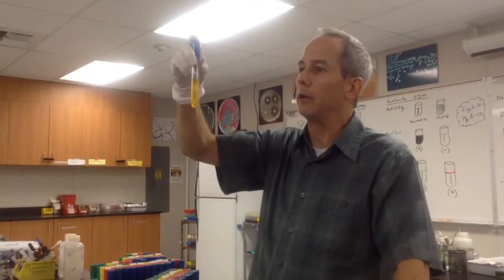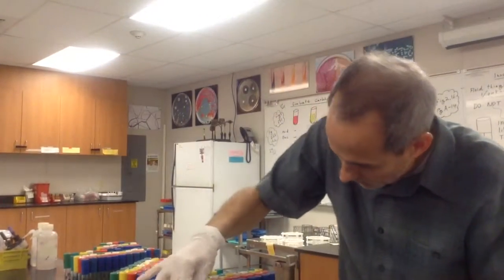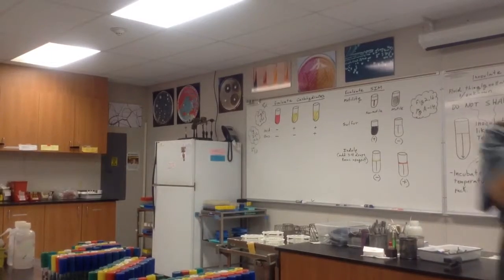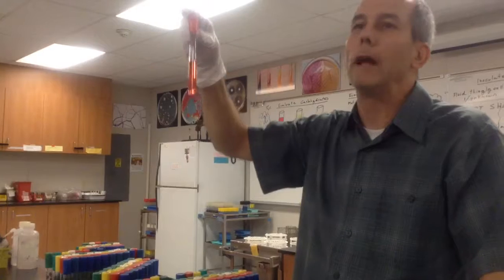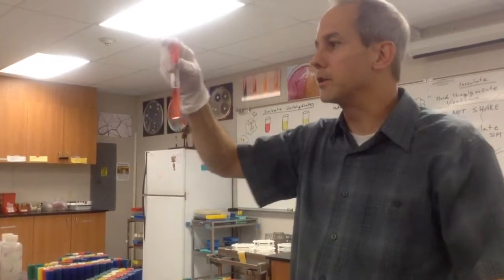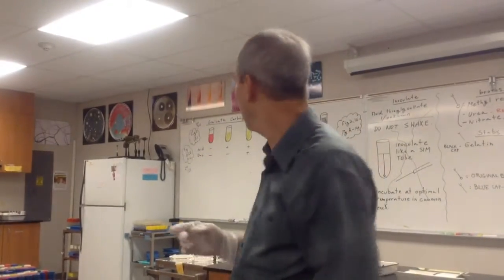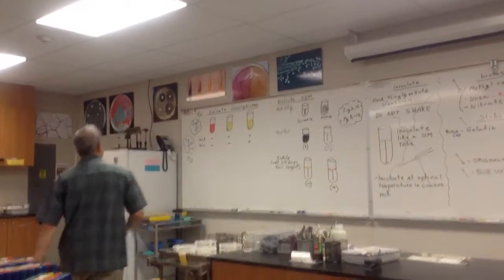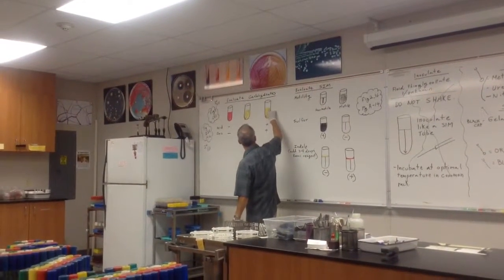Okay? So the next thing I want you to think about, you do understand it's impossible to have a negative result and then have gas. You can't have an organism that says, oh, I don't like to eat this sugar, but then starts farting all over the place. Right? So it's either going to be positive for metabolism and positive for gas, or only positive for metabolism. Right? So notice that this is all the combinations that we would have. And you see that air bubble right there.